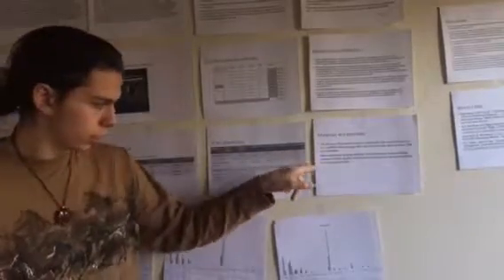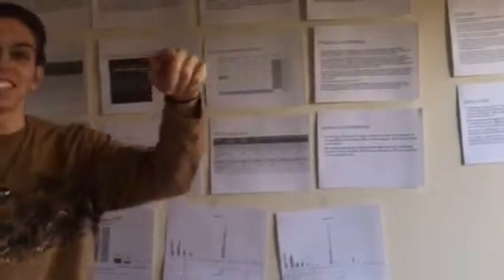We used a colorimetric assay to determine the concentration of our amplified DNA samples after PCR cleanup, which allows for more precise DNA concentration. DNA sequencing, done after the indexing PCR, determines the nucleotide sequence of the variable 16S ribosomal genes that we amplified from the fecal samples.